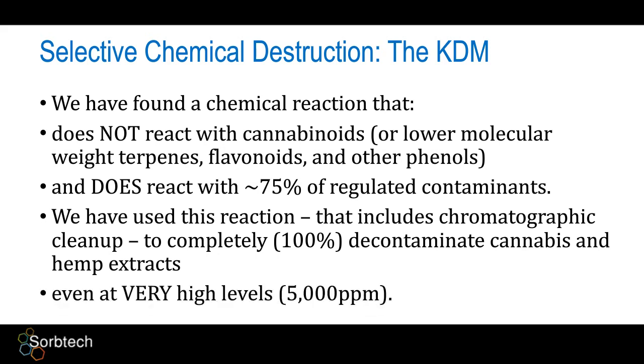We spiked it up to 5,000 ppm, which is a lot. It's more than you're ever going to find in any extract anywhere. That's 10 times more.